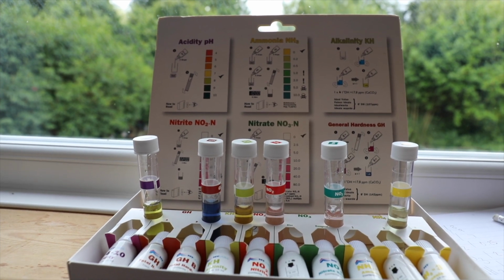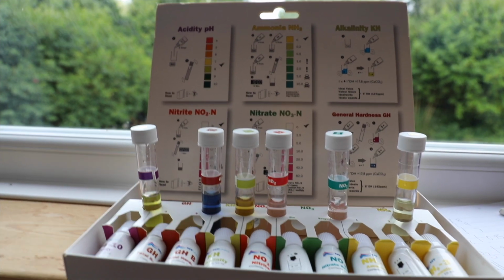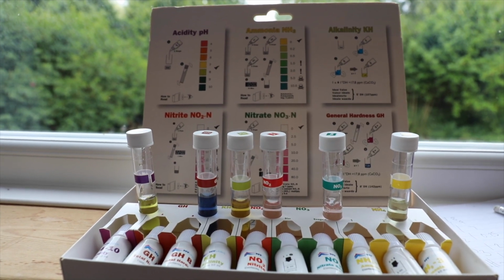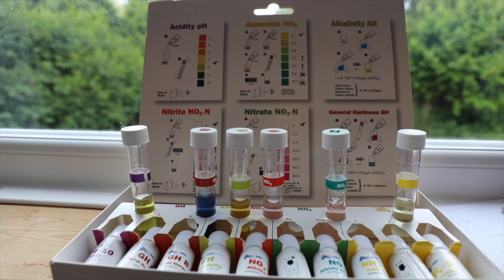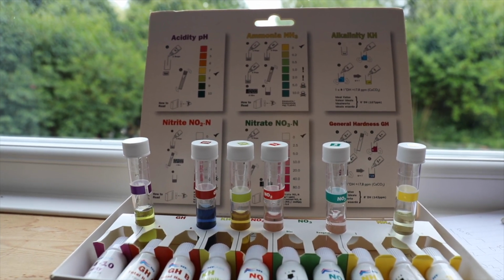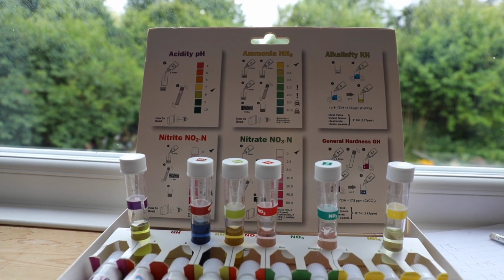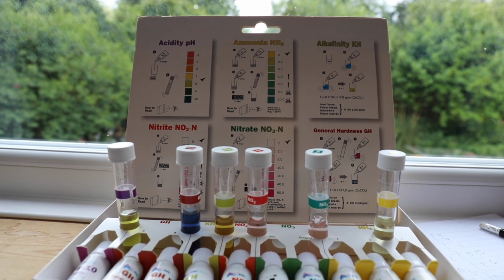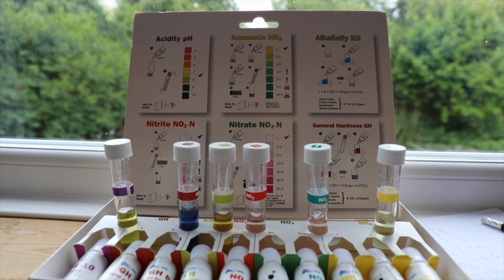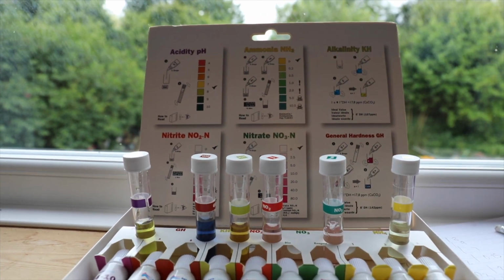The only treatment that's gone into the pond is a dechlorinator, and that's it. So this is a brand new fresh pond, first water test. If you can give me an idea or heads up whether you think this is good for now, whether it's going to get better or get worse. I know when you're starting a new pond, often things can go a little bit pear-shaped, so hopefully this is okay. And if anyone can give me advice on what these readings mean, I'm just going off the chart and the little tick symbols, so I think it seems to be okay.